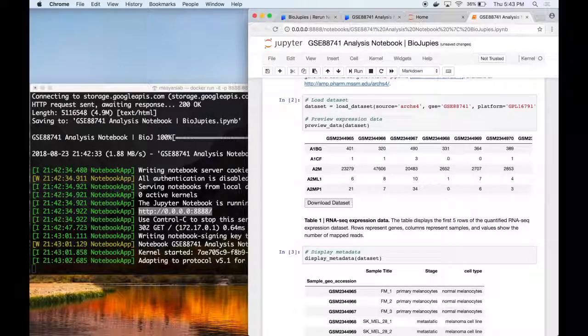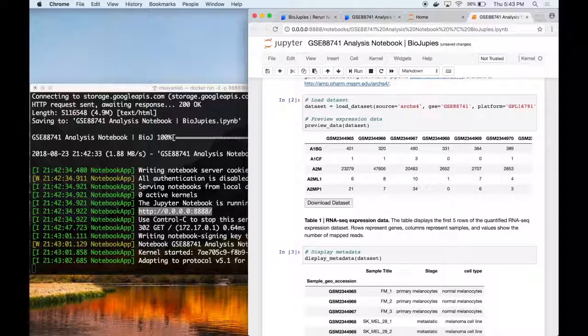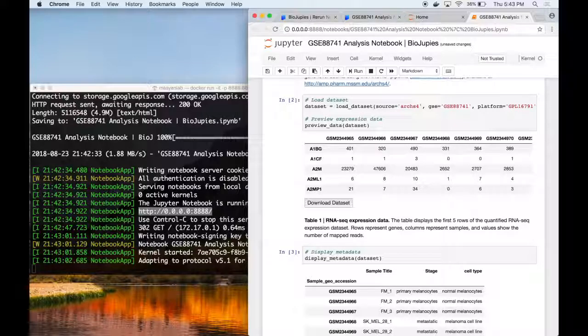You can then add your own code to customize your own analysis and then save any changes on your local file system.